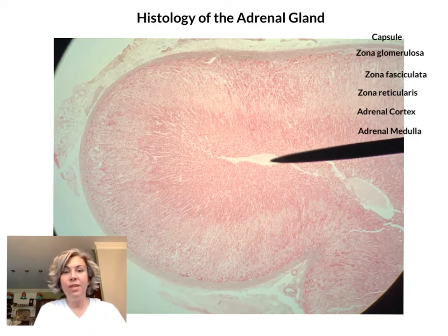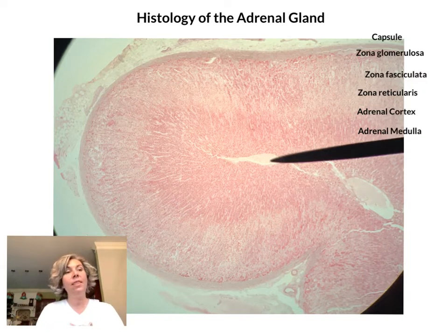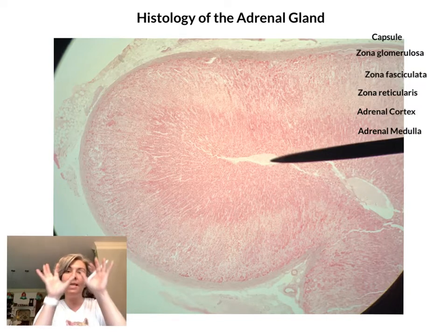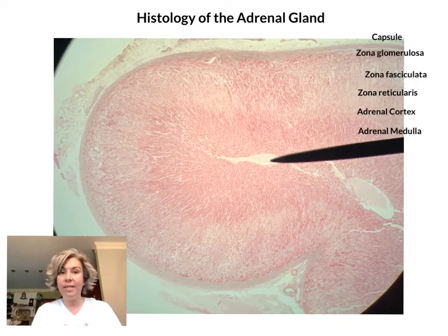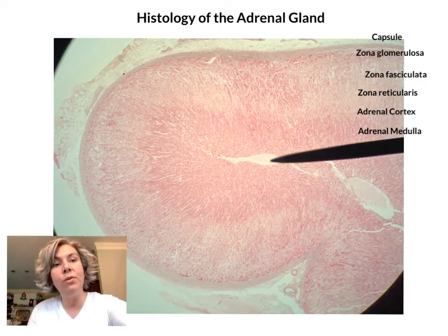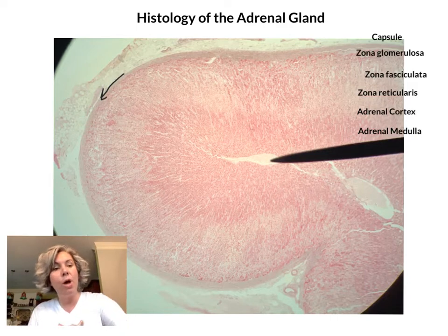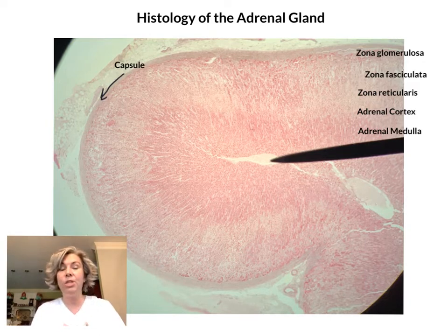We are going to examine the histology of the adrenal gland. The adrenal gland is a paired set of glands that reside just superior to the kidneys, and they are made of two main regions. The outer area is known as the adrenal cortex and the central region is known as the adrenal medulla. The entire gland has a covering of connective tissue around it known as the capsule. In this microscopic image, we can see the capsule on the outer edge — that light pink covering encircling the entire gland — which is fibrous connective tissue that supports and surrounds the adrenal gland.